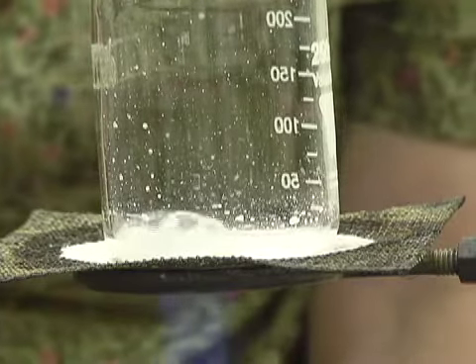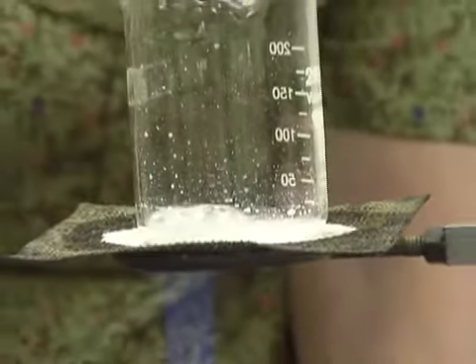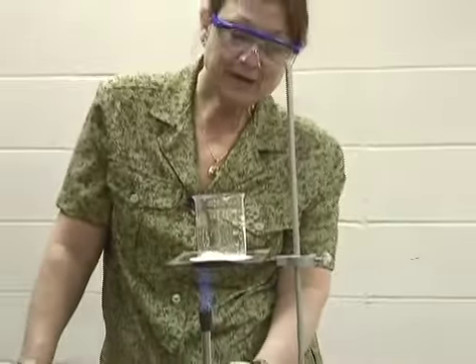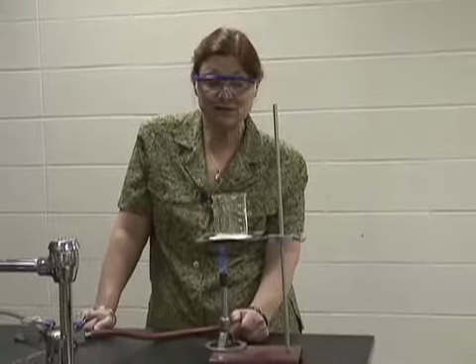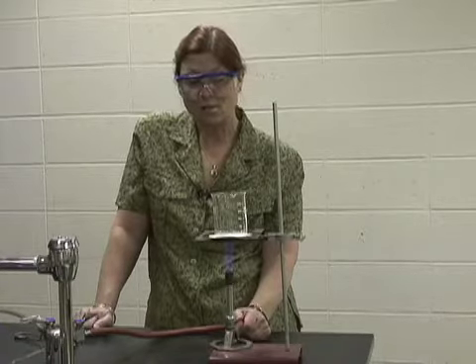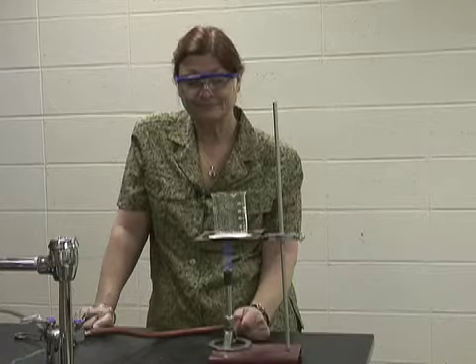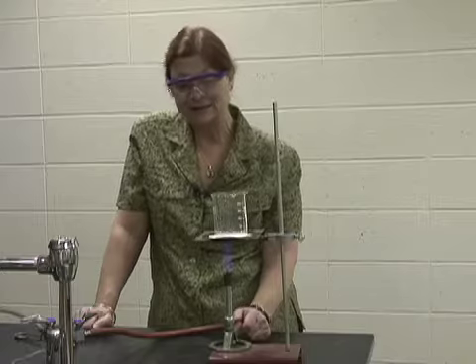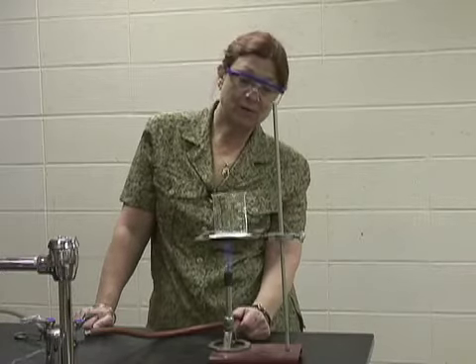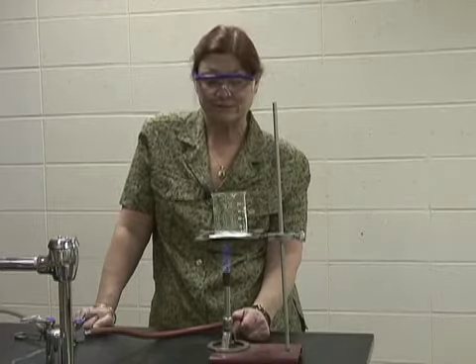Just trying to control the bottom there so that we don't do it too quickly. I see some splatters out on the sides there of the beaker, and hopefully we haven't lost any of that material, all that magnesium and chlorine product. Oh my, you can see that crystal's getting whiter because when it's damp it is darker colored, and as it gets more and more dry, then it's going to get whiter and whiter.